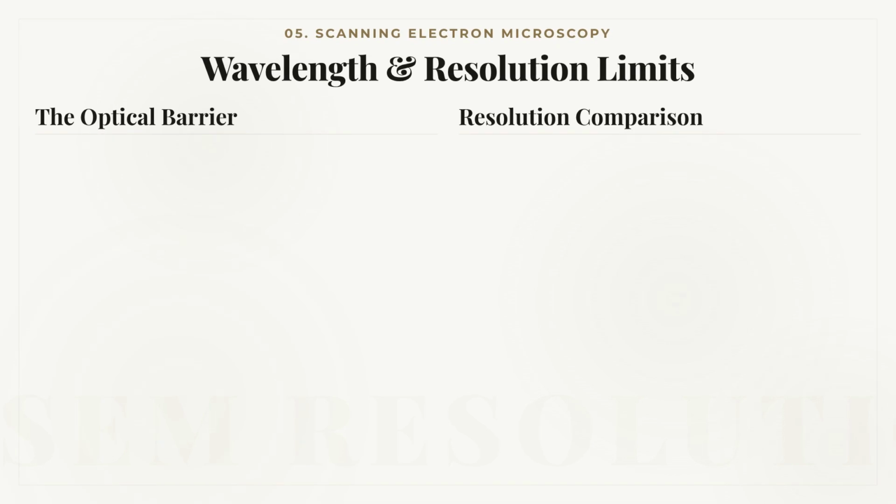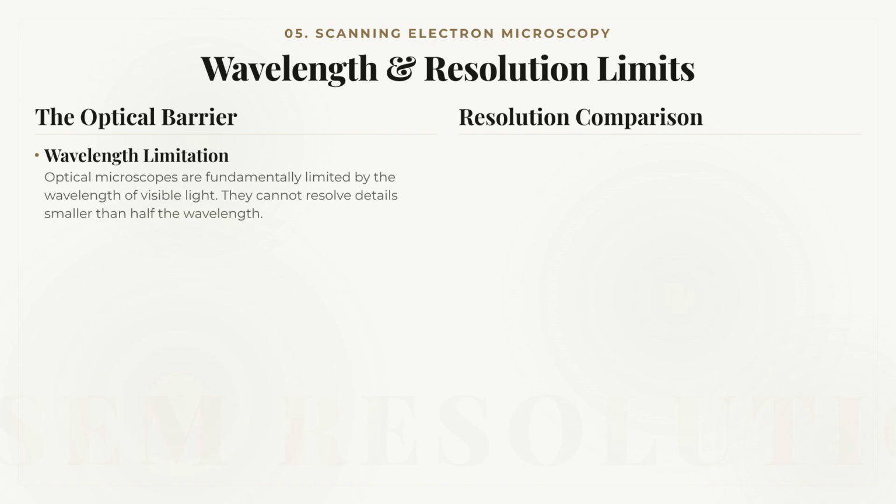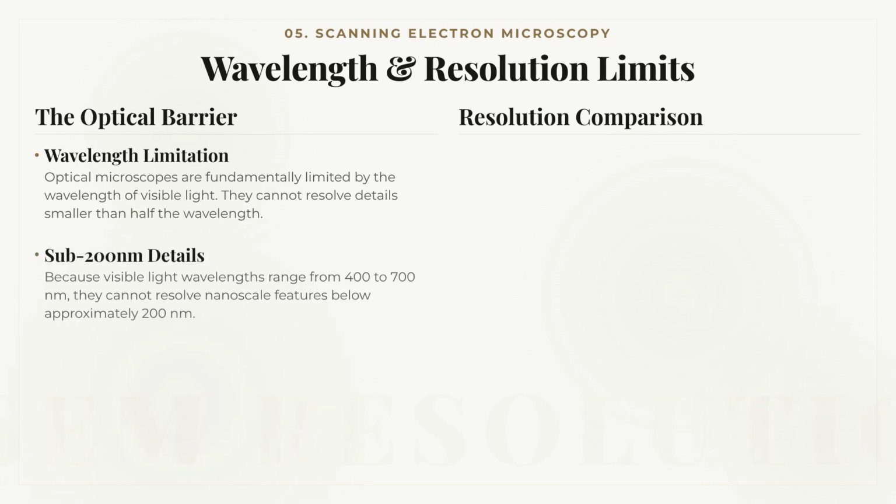Now let us move to another important characterization technique known as Scanning Electron Microscopy, or SEM. The optical microscope has played a major role in science for centuries. However, its resolution is limited by the wavelength of visible light. Visible light cannot resolve structures smaller than approximately 200 nanometers.